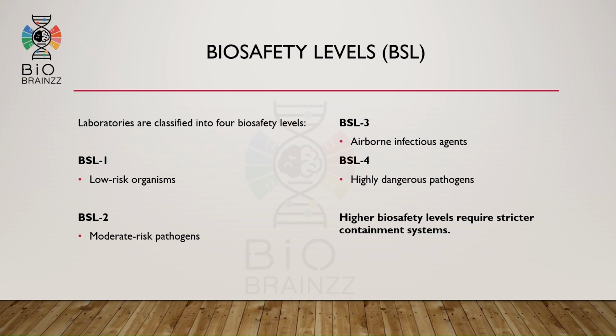Laboratories are classified into four biosafety levels depending on the risk associated with microorganisms. BSL-1 is used for low-risk organisms. BSL-2 handles moderate-risk pathogens. BSL-3 laboratories work with airborne infectious agents. BSL-4 laboratories handle highly dangerous pathogens and require maximum containment systems. Higher biosafety levels require stricter safety measures.